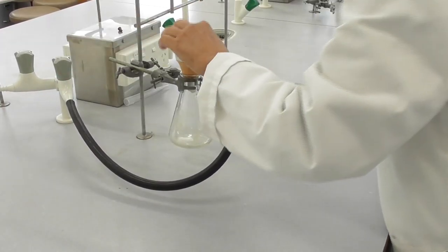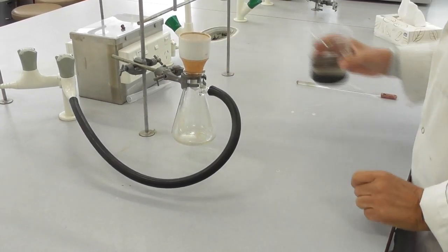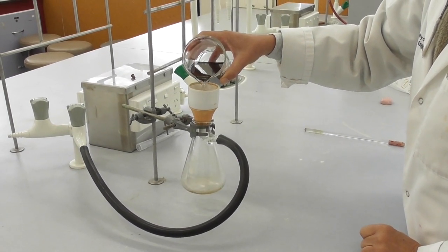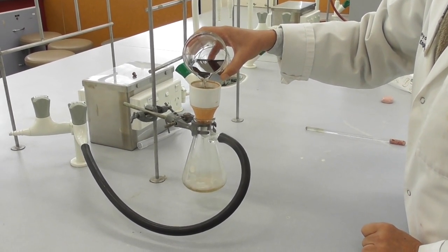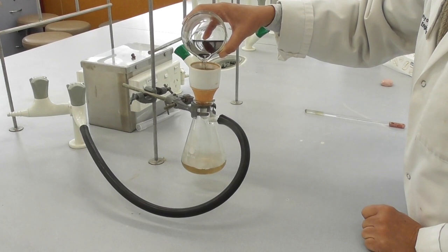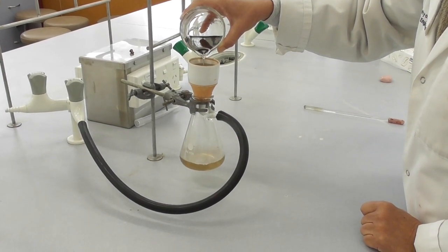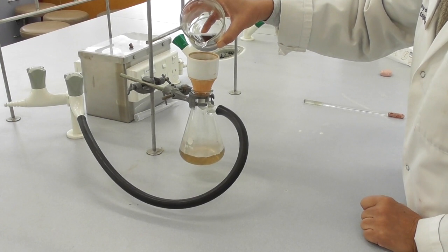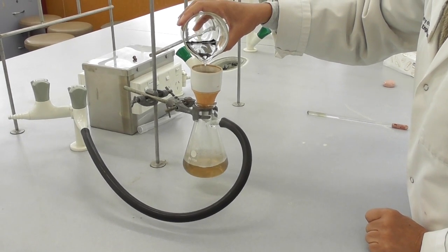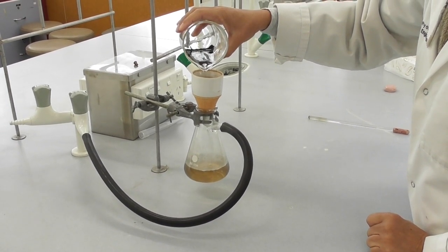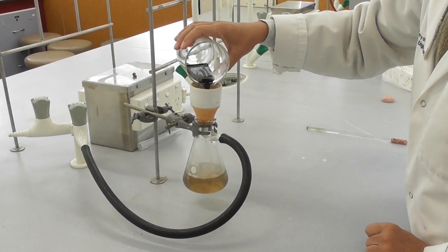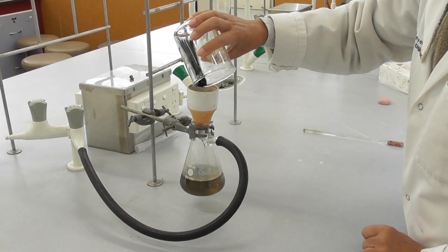I turn on the vacuum and then carefully pour my solution into the Büchner funnel. In this case I try to pour off most of the supernatant first and try to avoid getting the magnetite into the funnel, as the product is very fine and will clog the filter paper very quickly. Only when I have poured most of the solution through the funnel, I give it a little swirl to try to transfer my magnetite.